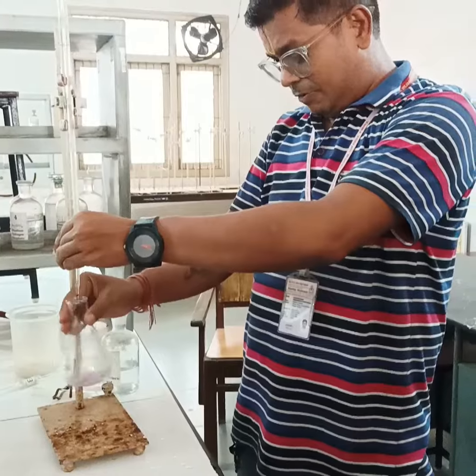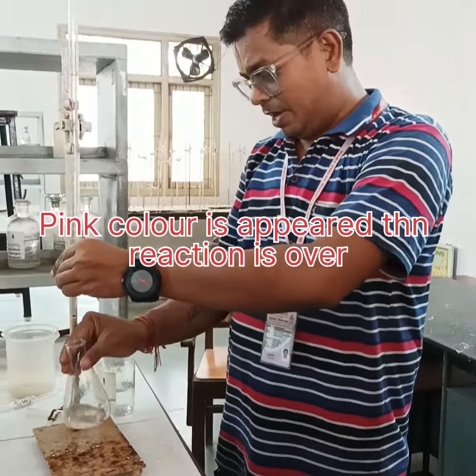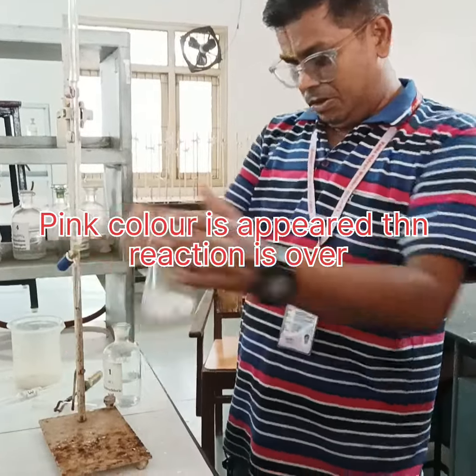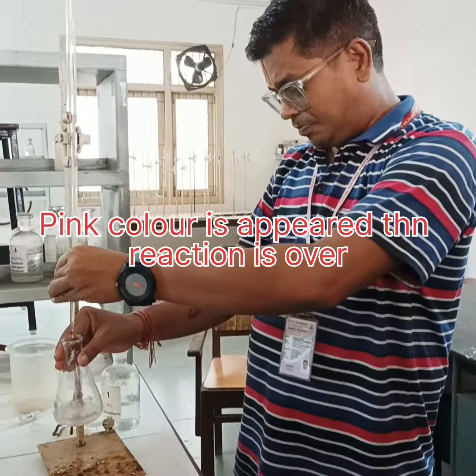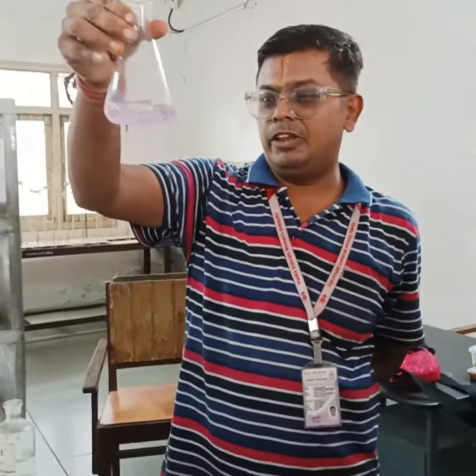You have to stir very carefully. I am going fast because I have no time. Otherwise, one more drop matters. If an extra amount is added, the reaction is wrong. See, the reaction is not over. Done? The reaction is over.